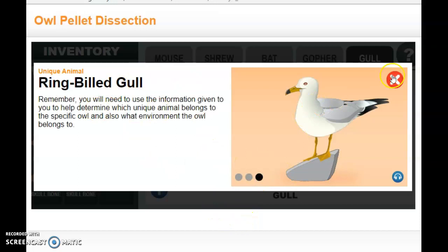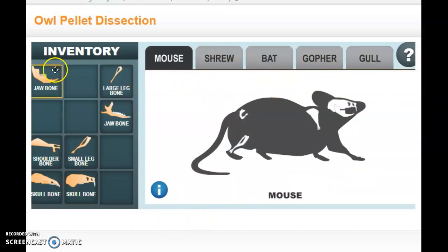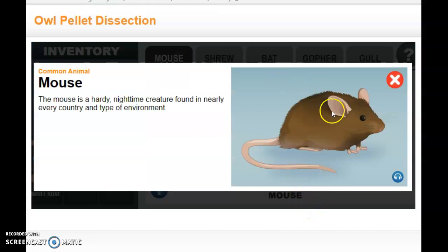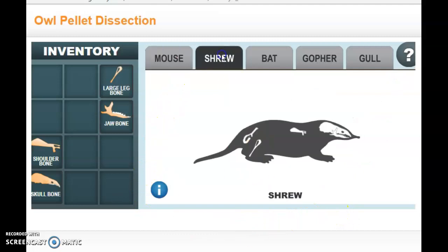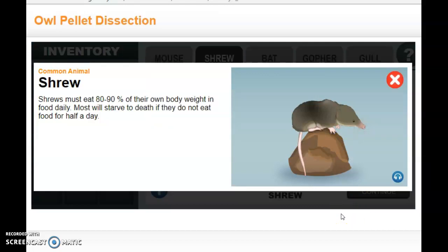Moving on, the mouse is a common one. I can see the jaw bone matches, a small leg bone, and the skull bone matches — it is a mouse. They're everywhere, so that doesn't help too much with location. Checking the shrew, this skull bone does belong, along with a shoulder bone, a large leg bone, and a jaw bone, so the owl did eat a shrew.